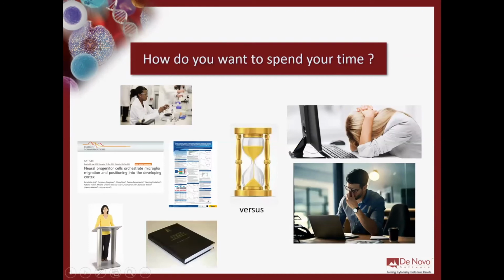In FCS Express, we want to see our customers and our researchers going back to the lab bench, publishing, putting together posters. Believe it or not, eventually we're all going to go back to going to conferences and doing these things in person. So we want to see you going back there as soon as you can, versus sitting in front of the computer copying and pasting, putting little white text boxes over axis labels. These people are very frustrated at having to do that all the time because they're not using FCS Express.